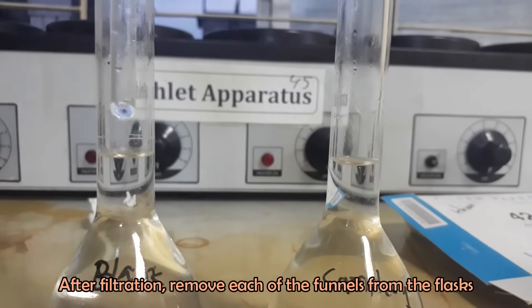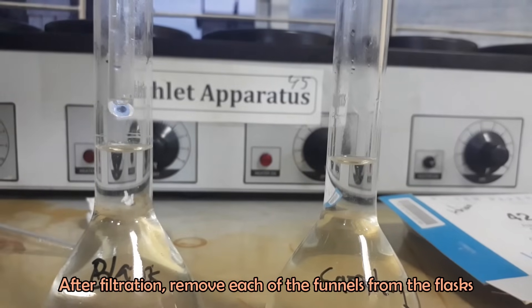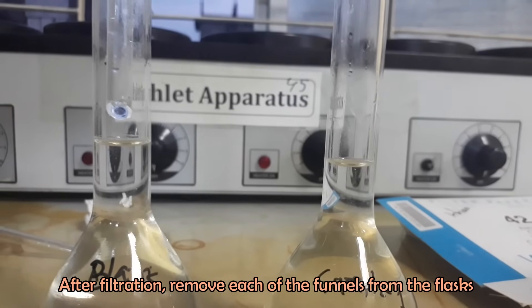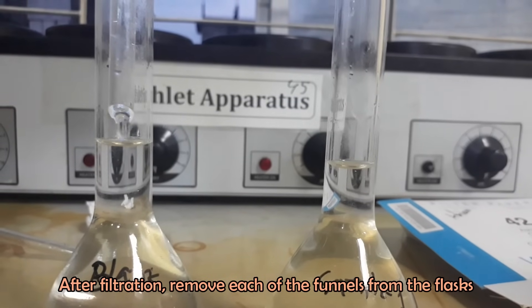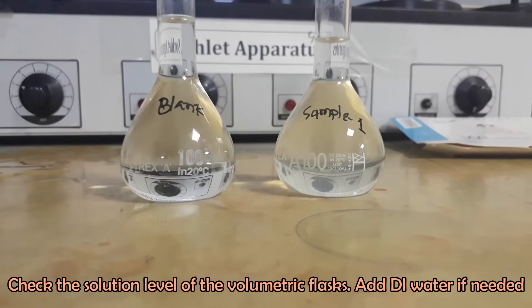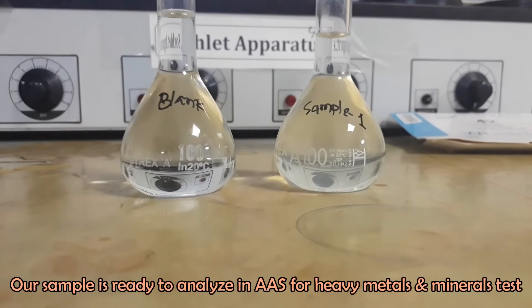After filtration, remove each of the funnels. Check the solution level of the volumetric flasks and level up to the mark with deionized water if needed. Our sample is now ready for analysis in AAS.